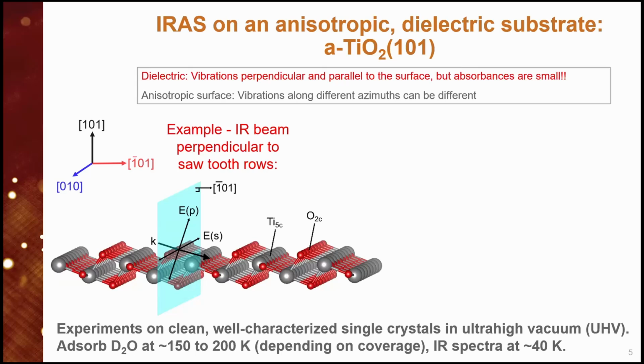So you have to work at it a lot harder, or you have to be very clever like you guys are and build a much nicer instrument than what I have. A couple things about infrared spectroscopy on a dielectric substrate are different. You get S-polarized signals. They're negative. They're always negative. They look like emission features. It's just an interference effect. And they're equal to the product of the real times the imaginary part of the index of refraction.